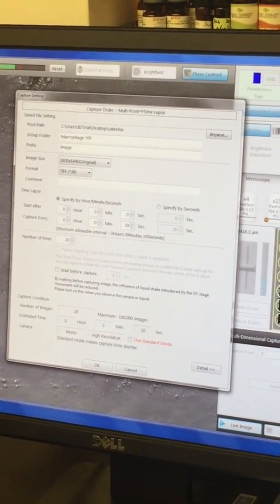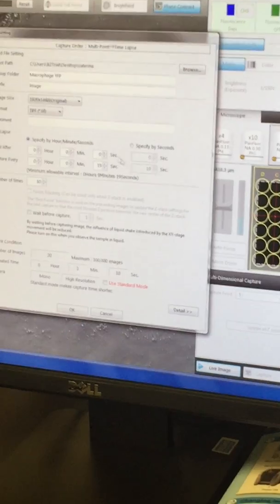Do you have them going on in every well? Yeah, it'll be every. Okay, so yeah, it's going to probably be closer to 4 minutes, let's say. But is that fine? Okay.